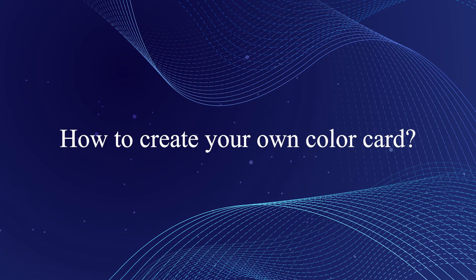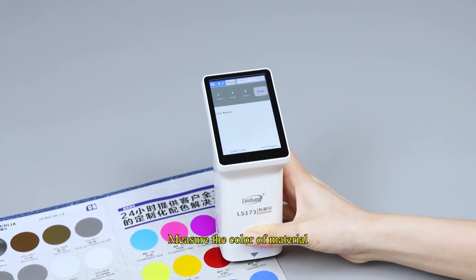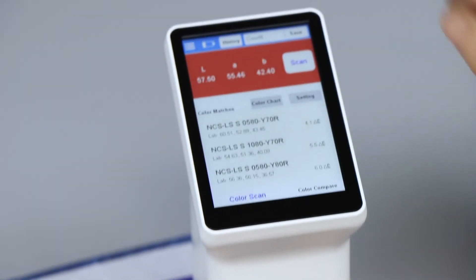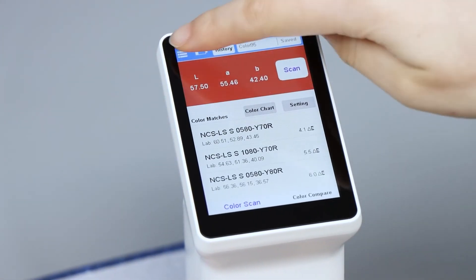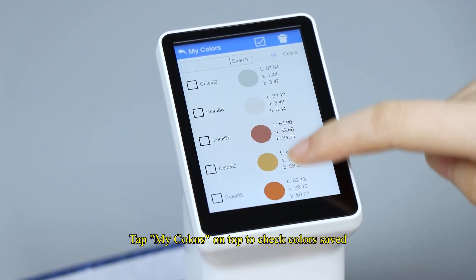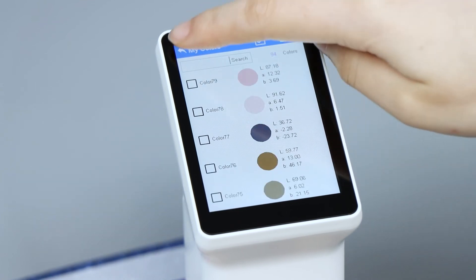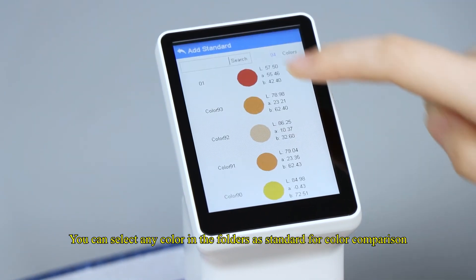How to create your own color card. Measure the color of material. Name it and store. Tap my colors on top to check colors saved. You can select any color in the folders as standard for color comparison.